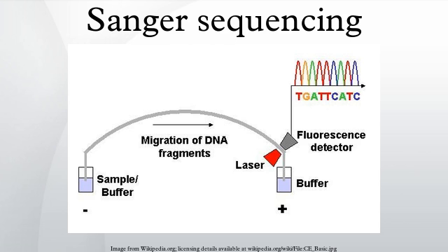DNA sequencers carry out capillary electrophoresis for size separation, detection and recording of dye fluorescence, and data output as fluorescent peak trace chromatograms. Sequencing reactions by thermocycling, cleanup and resuspension in a buffer solution before loading onto the sequencer are performed separately. A number of commercial and non-commercial software packages can trim low-quality DNA traces automatically. These programs score the quality of each peak and remove low-quality base peaks.